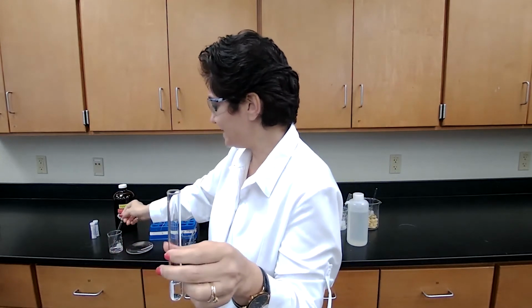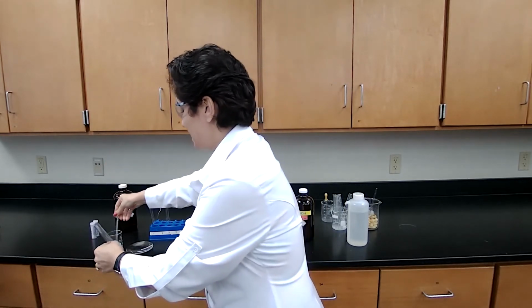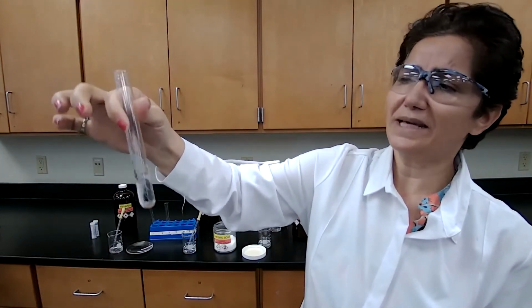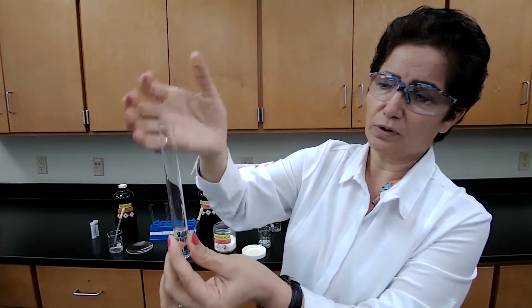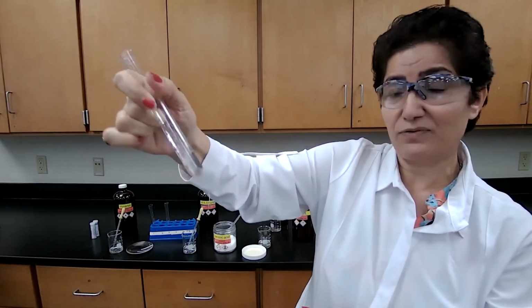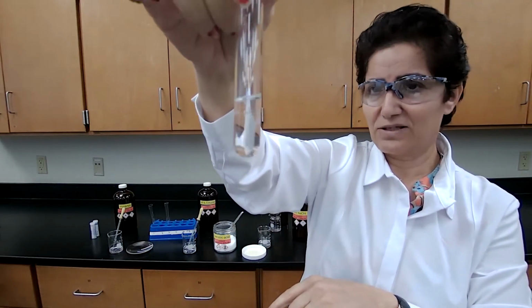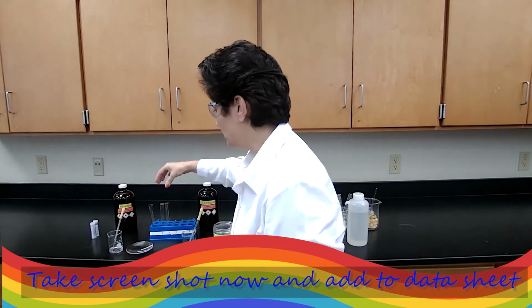Next compound is hexane in HCl. Hexane in HCl is not expected to dissolve because it's a non-polar compound, and we have polar solvent. So you would shake it well, and again, you can either cork it or use gloves and cover the test tube and shake it. I'm just shaking as vigorously as if I had the gloves. After shaking, you hold it, look for the layers. Now 2 layers have formed. It means that it's not soluble in HCl. The hexane is not soluble in HCl.